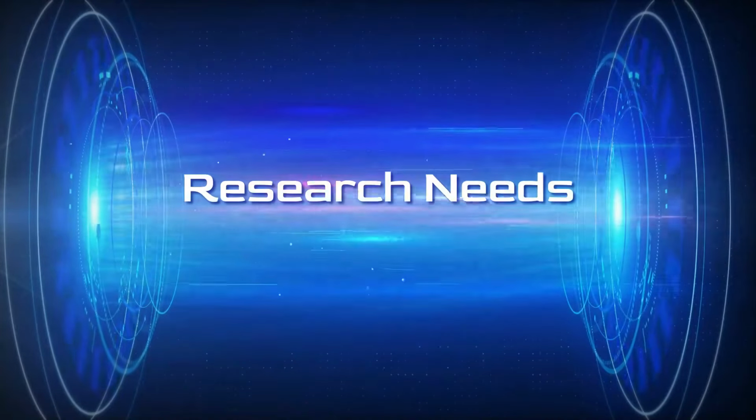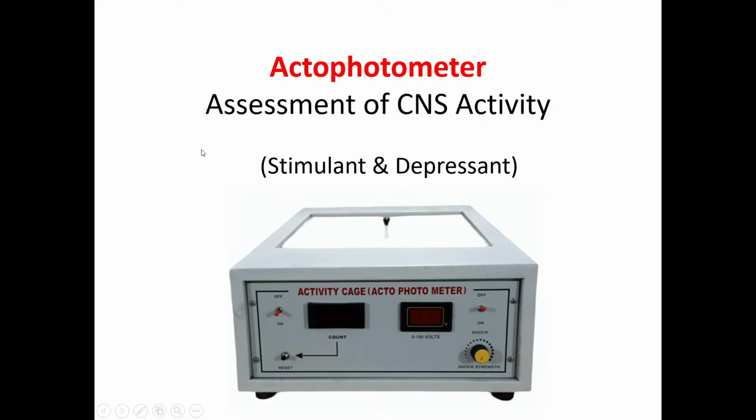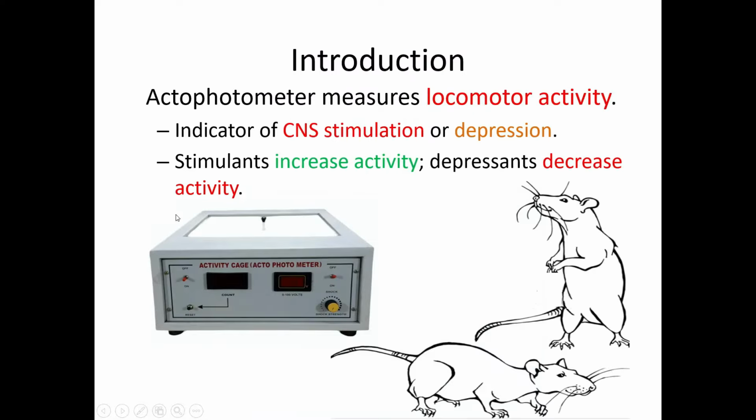In this video today we are going to see the Actophotometer. It is used for assessment of CNS activity, and the drugs which show stimulant and depressant activity we can screen by using this instrument. Now we will see next.